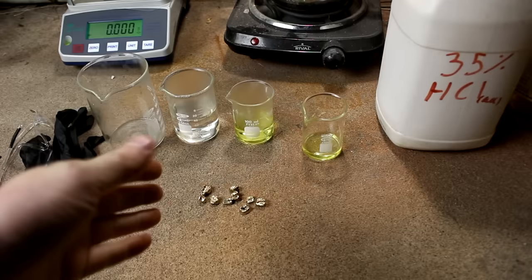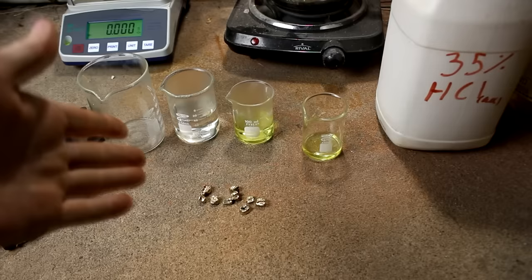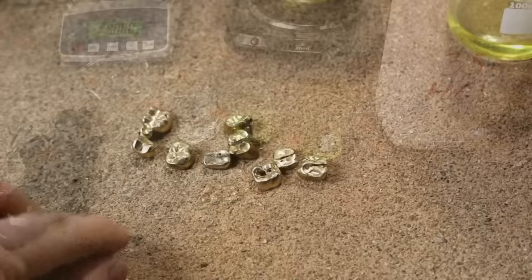Hi everyone, welcome back to Cody's Lab. It's been a year now since I started my precious metal refining series, and it's been a while since I've done the last episode, so I figured I'd start that up again and process these gold teeth.